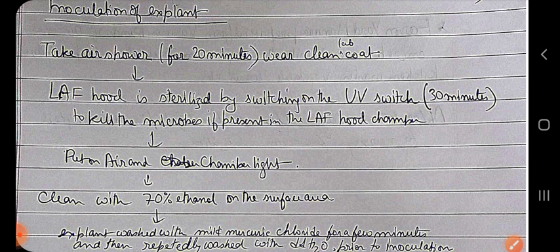For sterilization of the laminar airflow, we have to switch on the UV light, taking care that we shut down that hood, so that the UV light does not come in contact with your body, because it is dangerous. You have studied molecular biology previously, how UV light causes mutation. For 30 minutes it has to be used. That will kill the microbes if present in the laminar air hood chamber.